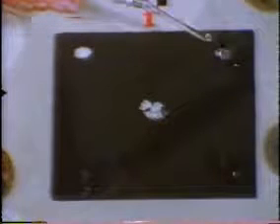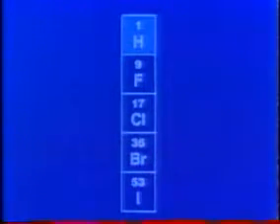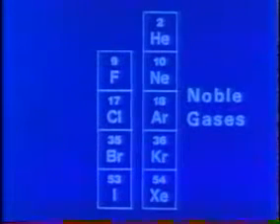The bromine compound acts similarly, as does the iodine. When water is placed on the hydrogen compound, it gives a rapid evolution of gas. Again, all but the hydrogen compound are similar. Thus, hydrogen is not usually included in this family of reactive and chemically similar nonmetals, each with 1 less electron than a noble gas.